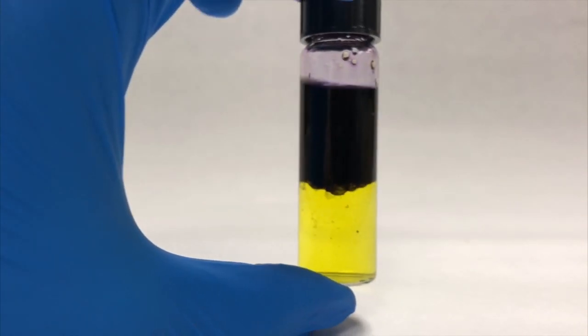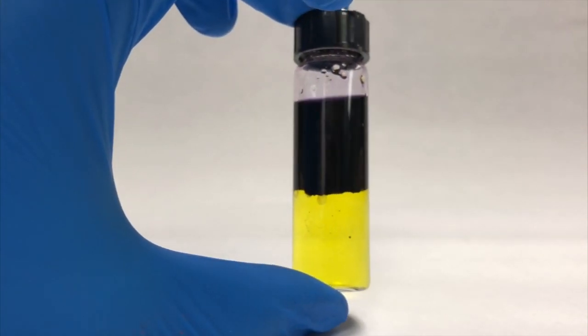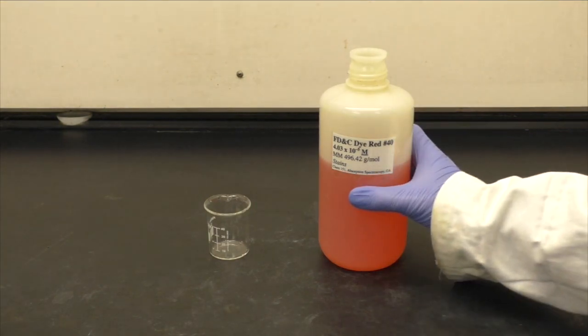The key to a qualitative test is doing things in very small increments and using only small amounts of chemicals.